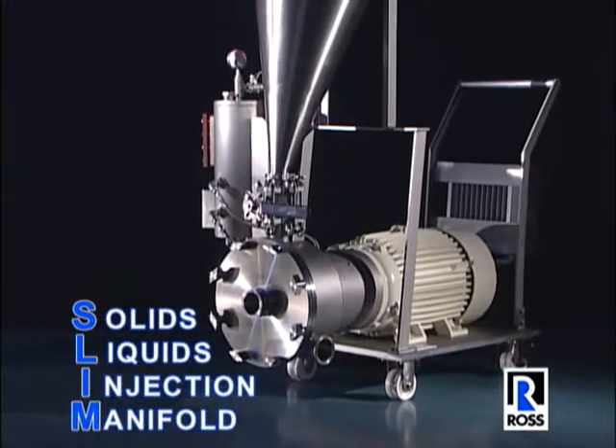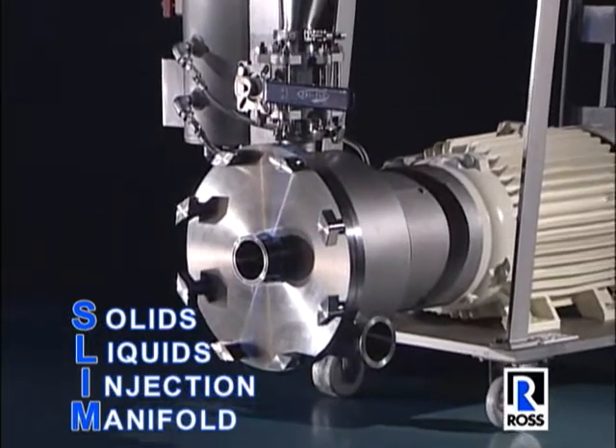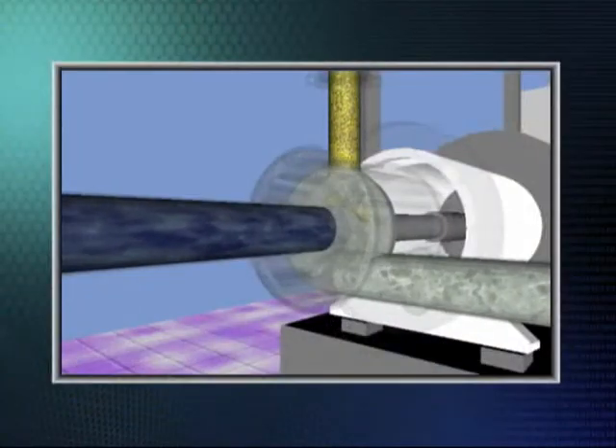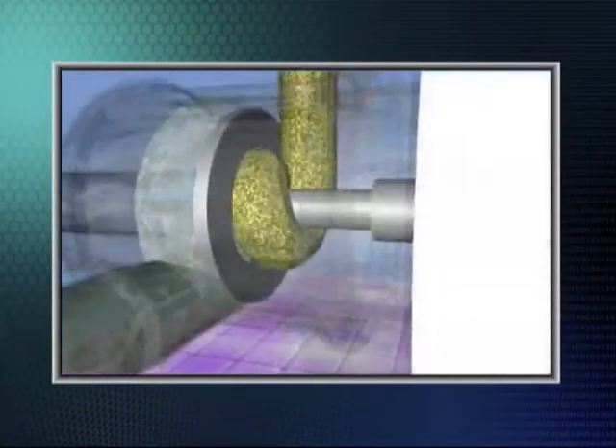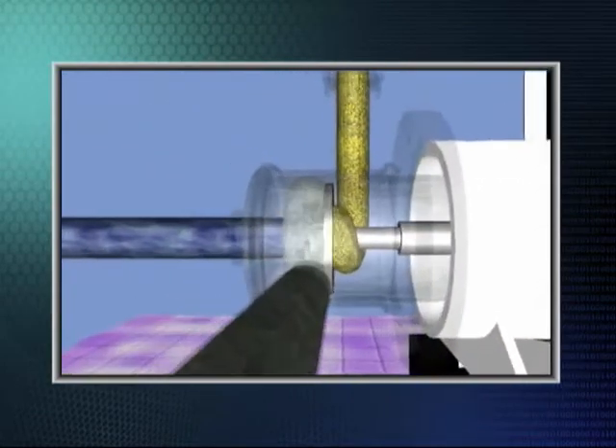The Ross Inline Slim System consists of a rotor and stator mixing arrangement specially designed to create negative pressure behind the rotor. This negative pressure injects powdered or liquid ingredients directly into the incoming liquid stream.